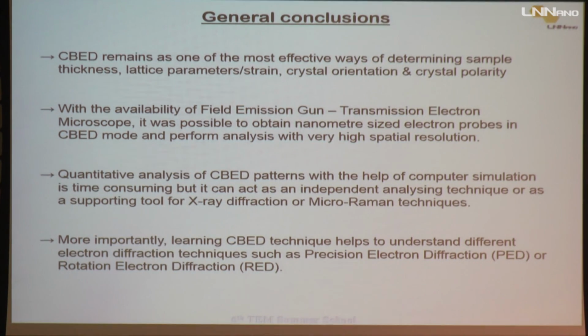And finally, more importantly, learning the CBED technique helps not only with this one technique, but it can make things very easy for understanding different diffraction-based techniques such as precession electron diffraction or rotation electron diffraction.